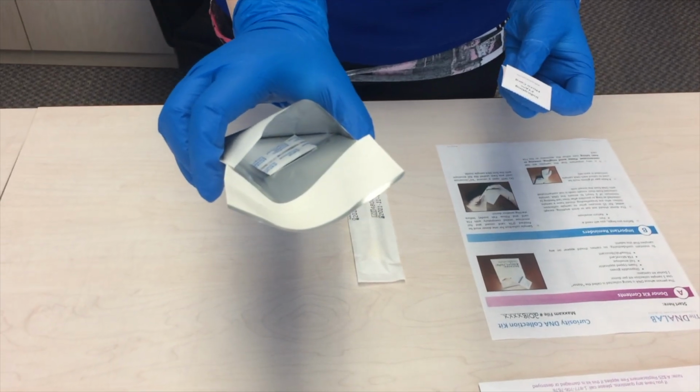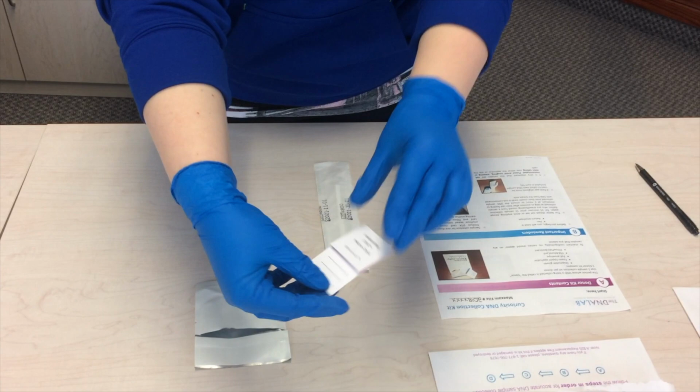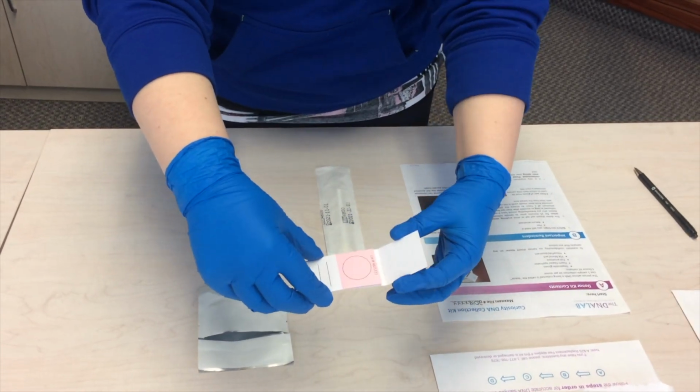Using new gloves, remove the FTA card from the foil envelope. Leave the pillow pack inside. Do not touch the pink part of the card.